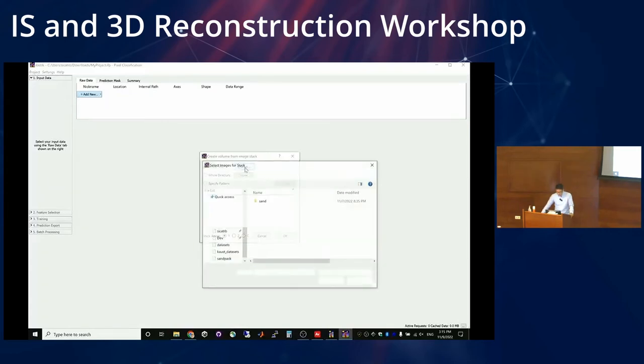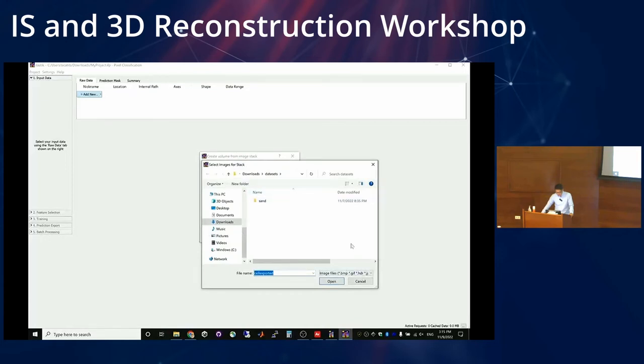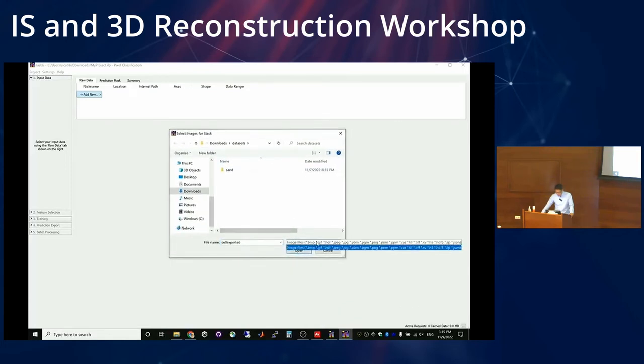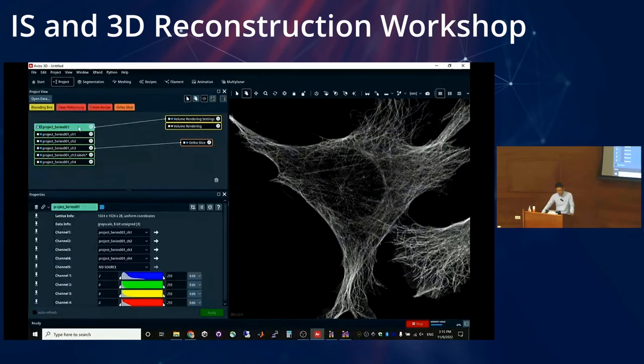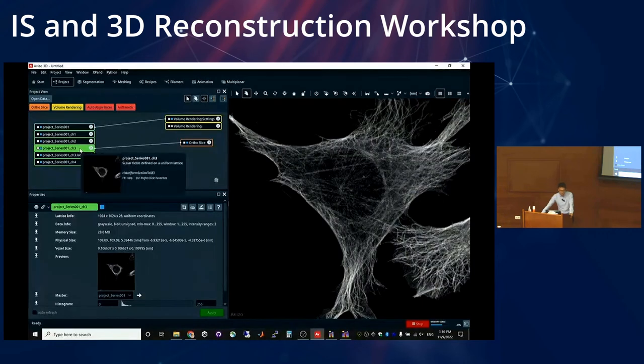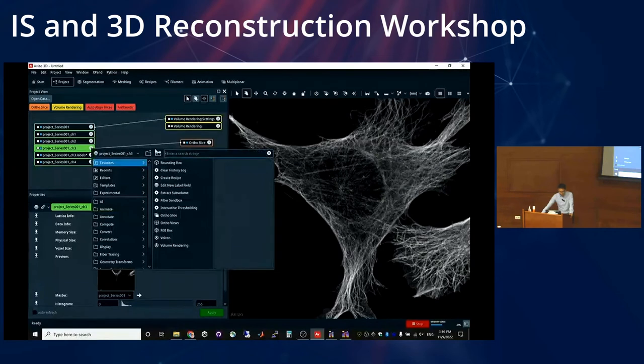And if you now select file and you go to the dataset folder, it can't find anything. These are the formats that it by default supports. So it doesn't support the LIF format, obviously. So what we'll have to do is go to Avizo. I should have given you the exported version, but anyway, go to Avizo and click on the channel 3. Click on this circle here. And here, this is the export icon, right?